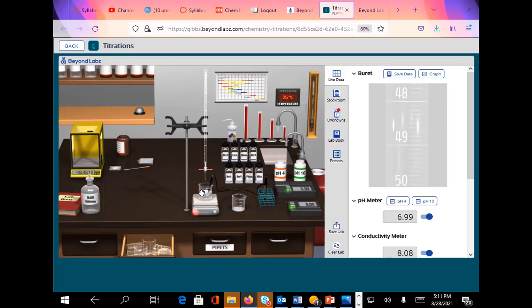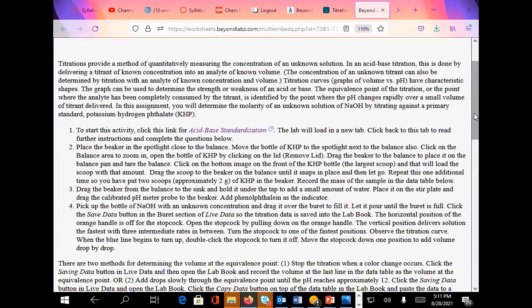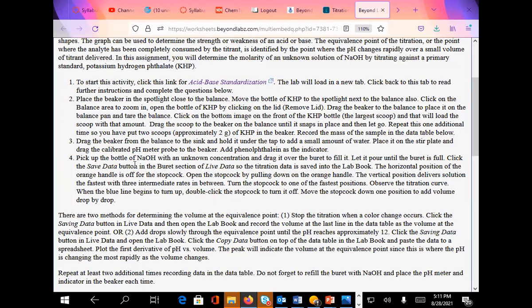Okay, now we're going to add the phenolphthalein. Here's the phenolphthalein. When you do this, it should get pulled up into its little spot. If it gets pulled up into the little spot, then you know you've added okay. So to find it. That's too high. Oh, did you see that? That means I added. Okay, so now we're going to see where we are here on our directions. So we did 1 and 2. We did number 3. So now we are on step 4 with the NaOH.